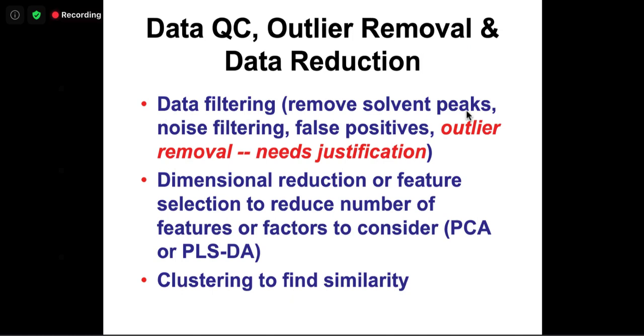So in transcriptomics or RNA-seq or microarray, there's a tradition: usually you can remove almost 25% of all the genes based on either their abundance or variation, and almost always improve the downstream. So we're talking about the comprehensive transcriptome or global metabolomics, which contains a lot of this noise.